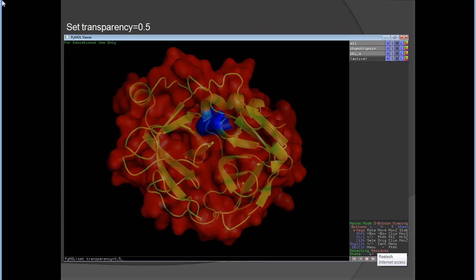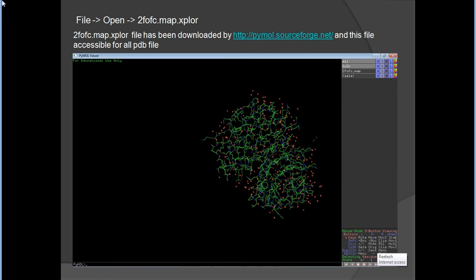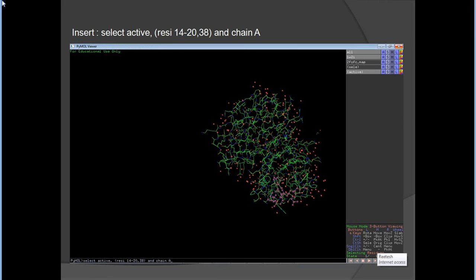In the last section, I will describe the electron density map. I randomly selected 1W2I as a PTP entry from the Protein Data Bank. Go to File > Open and load the 1W2I file. Importantly, you also need to download the '2fofc.map.xplor' file from the same source.